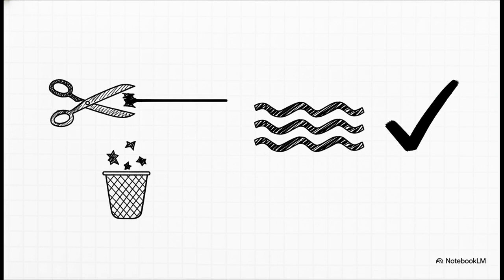We trim away any of those leftover adapter sequences, we snip off deteriorating bases at the ends of reads, and we filter out the low-quality stuff. But hold on, here is a massive point to remember. In RNA-seq, we never ever remove duplicate reads.